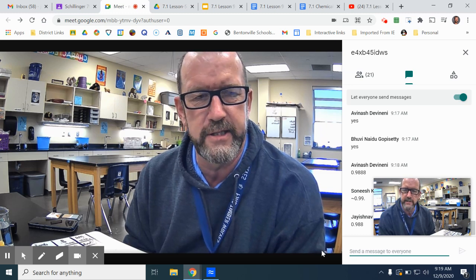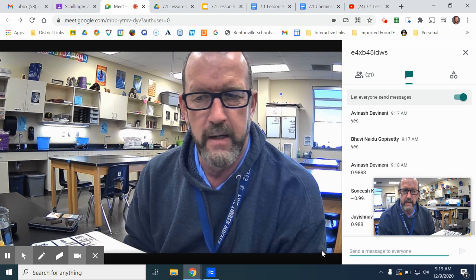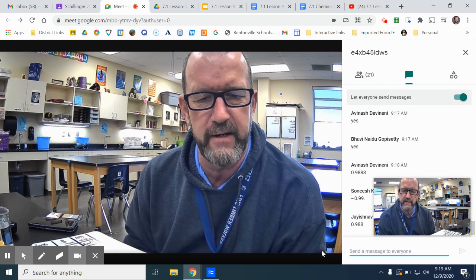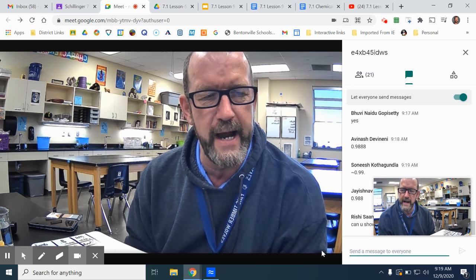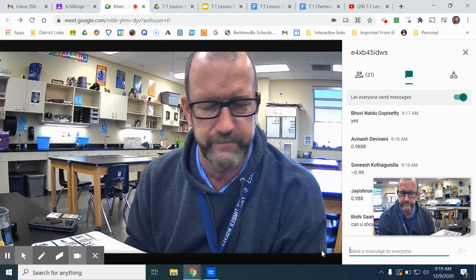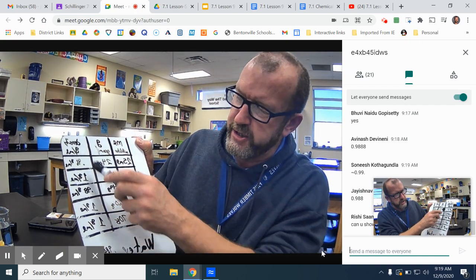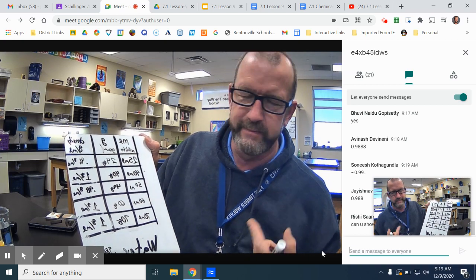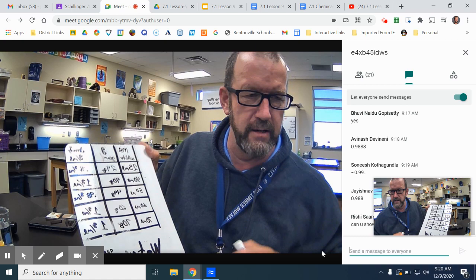It's also considered to be 1 cubic centimeter. So if I take 1 cubic centimeter of water, that should weigh 1 gram, which also gives me the density of 1. So because I have 3 at 1 and 2 just under 1, I'm going to say that was human error.